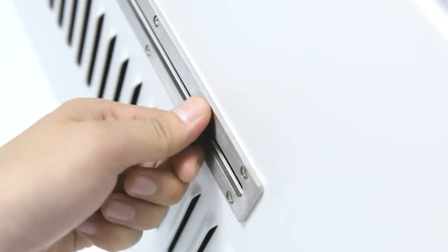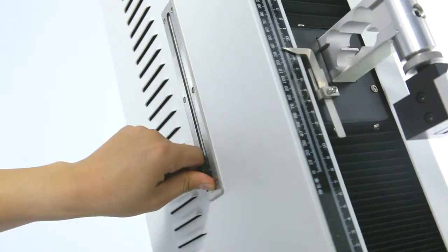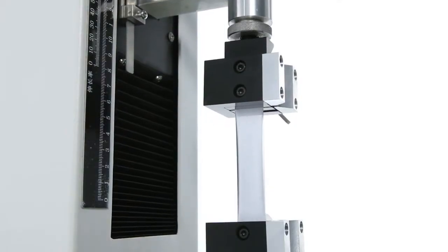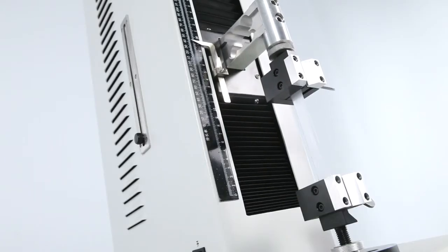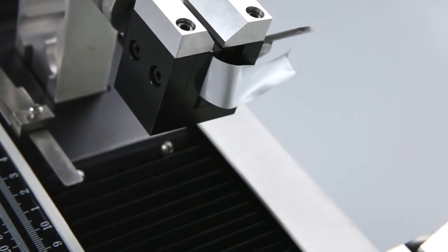It provides packaging users and manufacturers with a highly cost-effective solution for testing the mechanical strength of flexible plastic packaging materials.